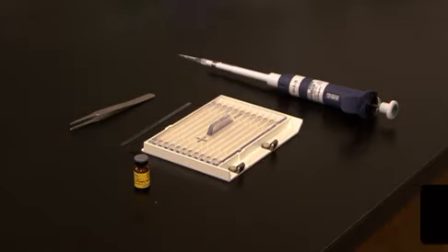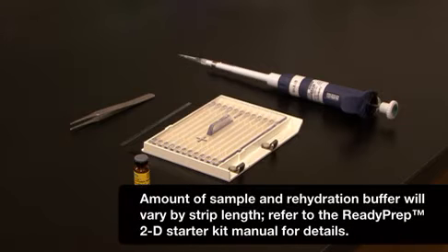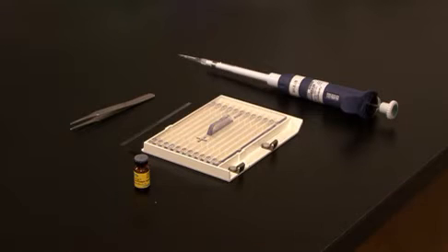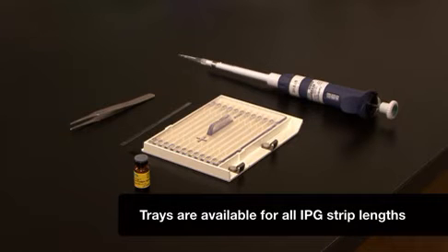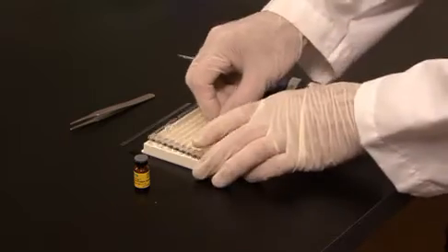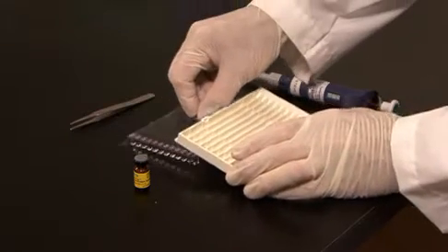To rehydrate the strip, I will load 200 microliters of sample into the focusing tray in each lane that I'll be running a strip. I am using a focusing tray that is specific for 11 cm strips. Trays are available for all IPG strip lengths.